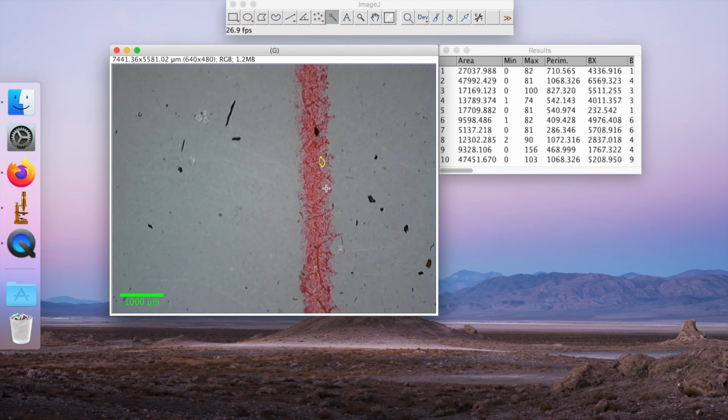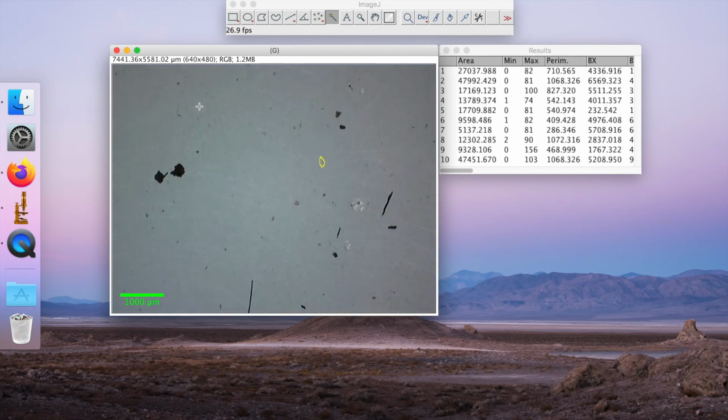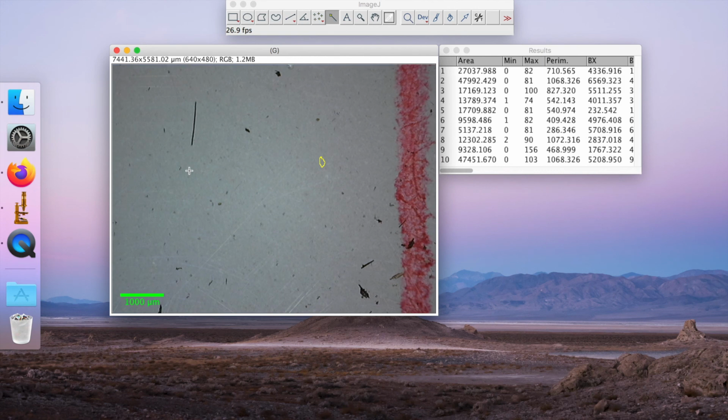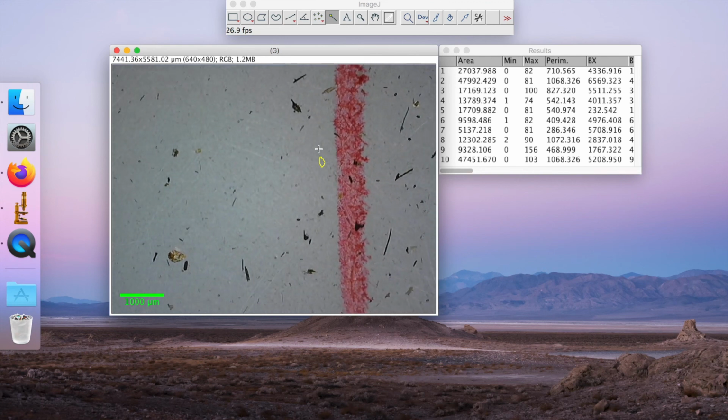I'll go ahead and put a link up on my website that shows a schematic of how I create these different quadrants. Often I'll have different lanes that you can move down through with a line on either side, so you can quantify charcoal down and up and down and up, moving through the 4 quadrants that I divide this petri dish up into. I'll put a link to that on the website so you can see exactly what I'm talking about there.